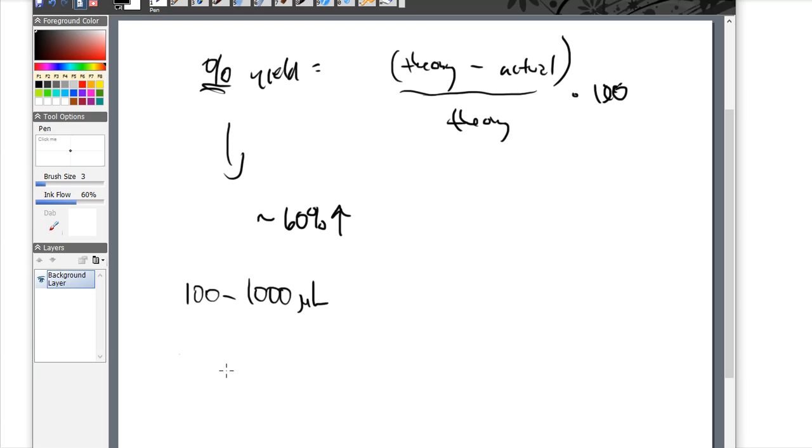They're different prefixes, though. I'm going to give you the short-handed version of this just because it's not general chemistry, it's not dimensional analysis, it's not shifting a decimal back and forth. I mean, that kind of stuff can be taken care of in a different class. The easiest way for us in a lab to go from milliliter to microliter is to move the decimal 3 times. All right, so what that means is that 100 microliters is actually 0.1 milliliters. There's 3 zeros or 3 placeholders, magnitudes, that are different between those two numbers. So 500 microliters is actually going to be 0.5 milliliters, okay?